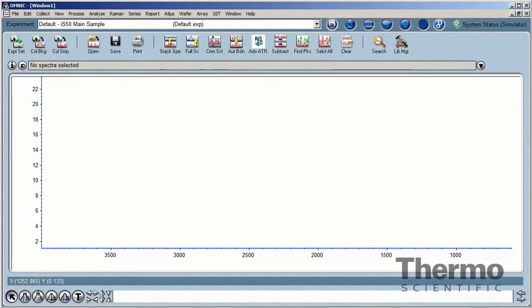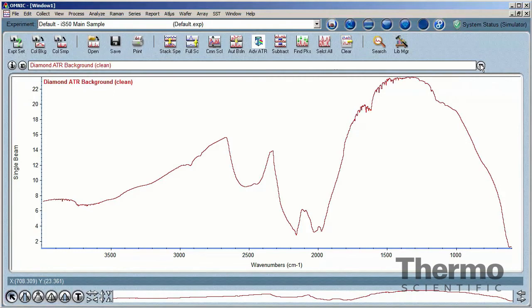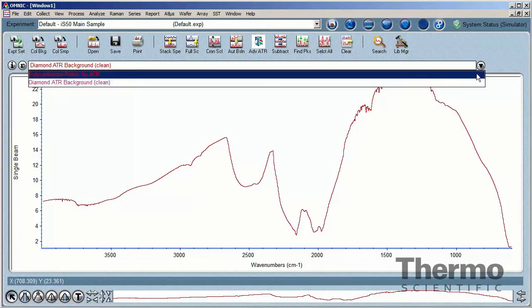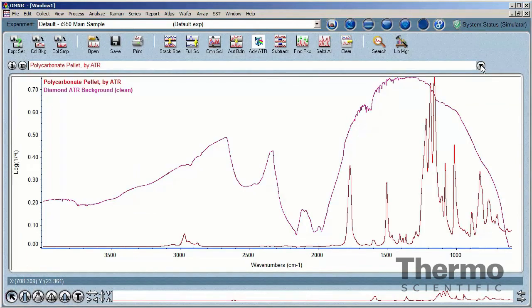Contact with the crystal is required for the spectrum to be generated. The clean crystal is first scanned to produce a background spectrum that will be used to normalize the sample spectrum for features from the instrument. The sample is then brought into contact with the crystal and the sample spectrum is collected. Good contact with the crystal is required, and for solid samples a pressure device can be used to press and hold the sample onto the crystal surface.